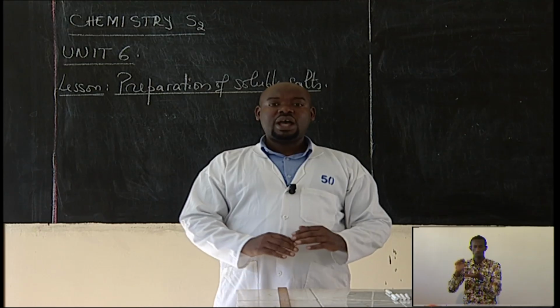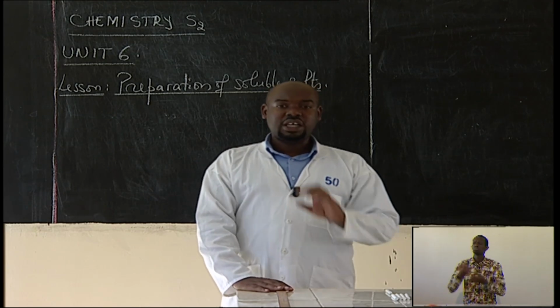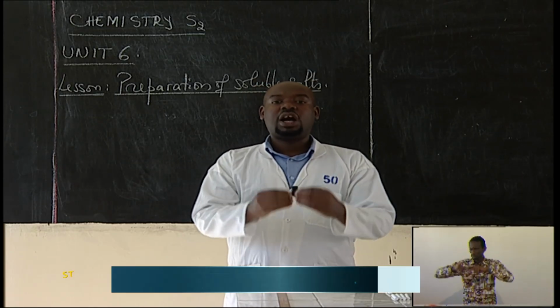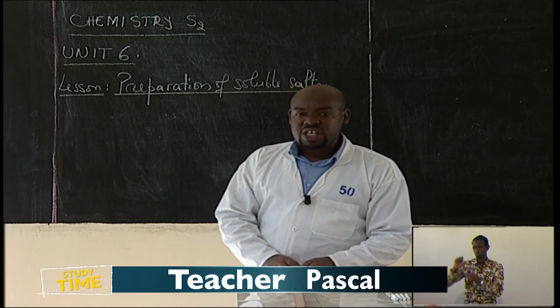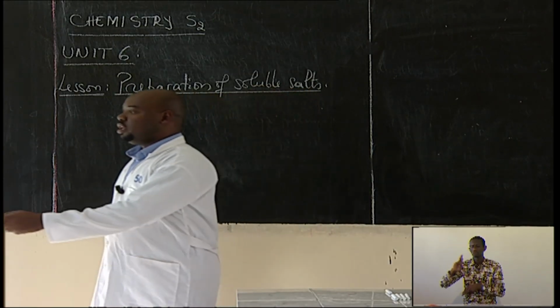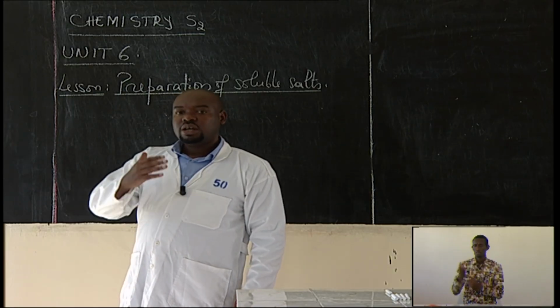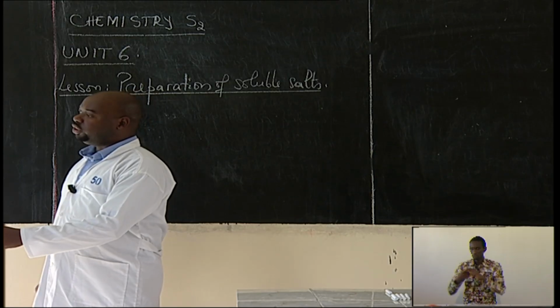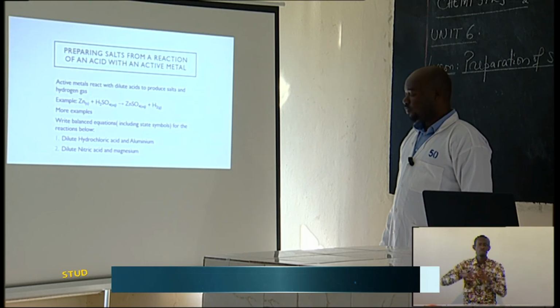So when you get a saturated solution and supersaturated solution, at a given time, solids will start to form. And the solids are the ones we call crystals. So you should always proceed with crystallization after producing this solution. You evaporate the excess water up to the point that solid particles will start to form. And then the hydrogen gas, which is here, will escape from the reacting mixture.